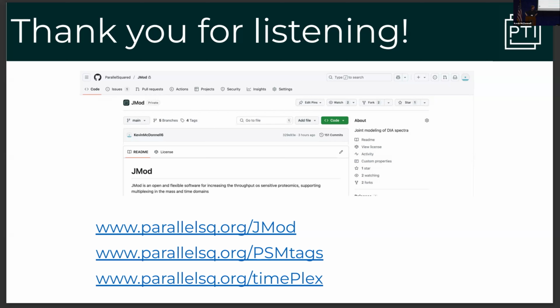Yeah. One of the things Jason has done great work on is, if we are acquiring multiple samples from the same column over time, you have to do this normalization for all the different samples. But what happens when you have 3 columns spraying together, you have spray issues, variable spray. You need to normalize the intensity that's been sprayed at the column.